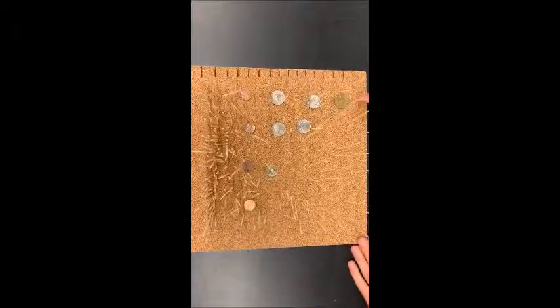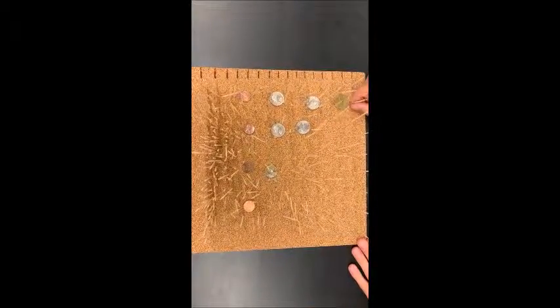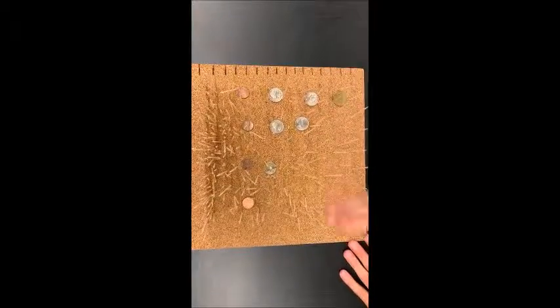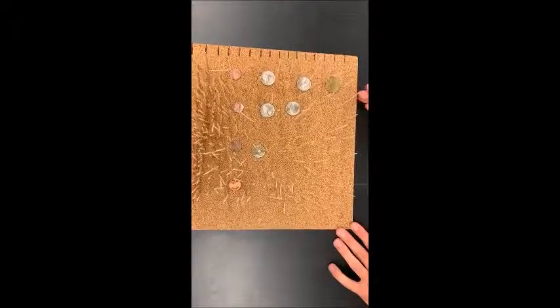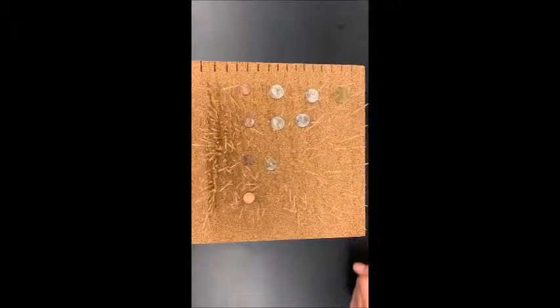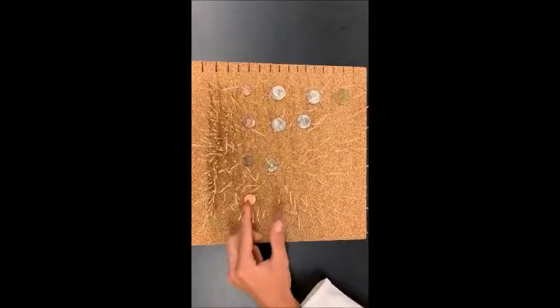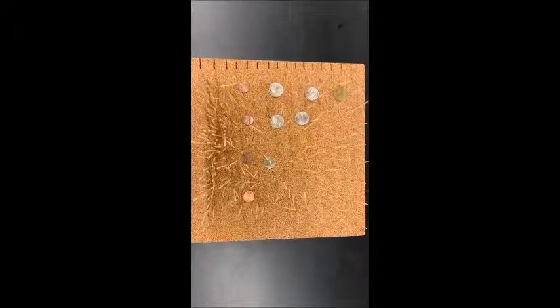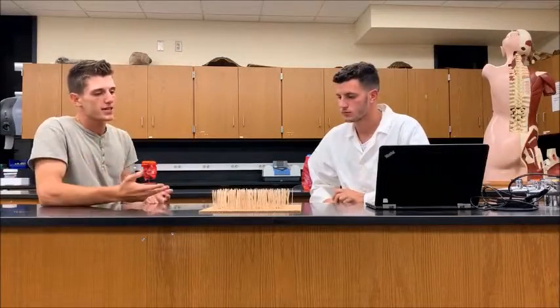As you can see, the less purified fractions contain more proteins with different molecular weights that stop in the gel. Going through, we get more purified protein until we end up with our only recombinant protein, DHFR, that we can assume is that one because the molecular weight stopped exactly where we know from our control. All right, yeah, that makes sense.